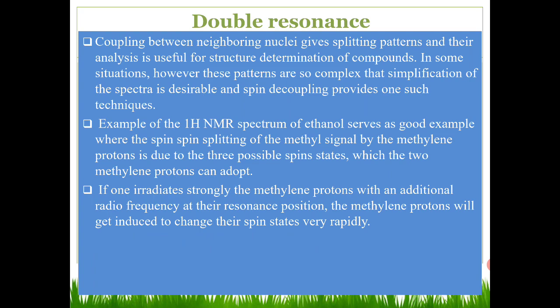It will be a single peak. So, this is the technique: if you irradiate strongly the methylene proton with an additional radio frequency at their resonance position, the methylene proton will get induced to change their spin state very rapidly. When they are rapidly changing, the NMR cannot identify each spin state separately.